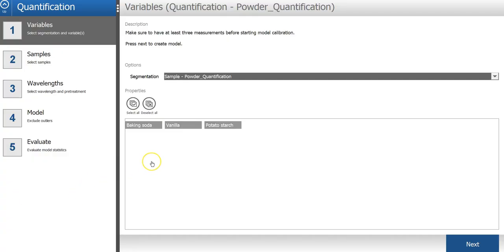I will press the add button and then select to do a quantification model. In the first step of the quantification model wizard, I will include all three properties in the model.